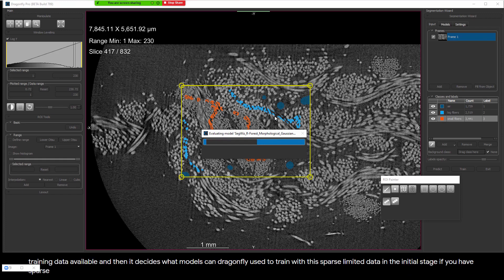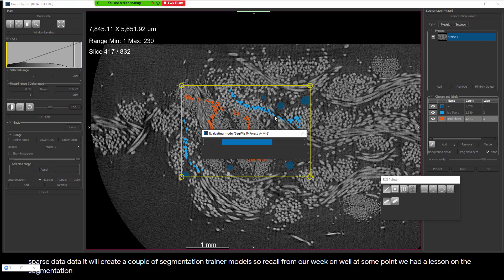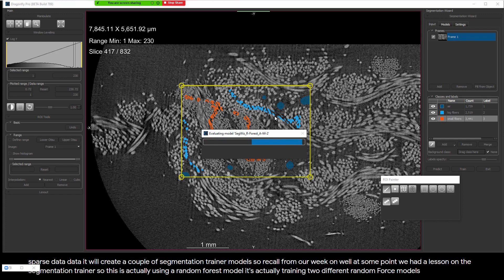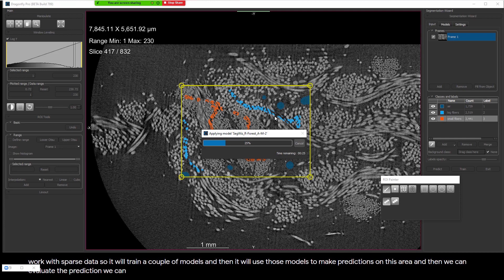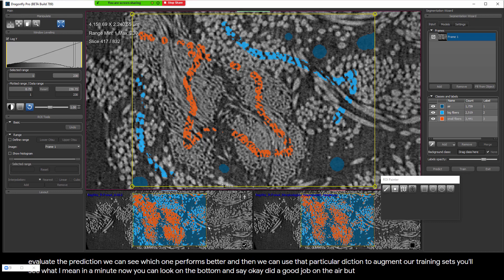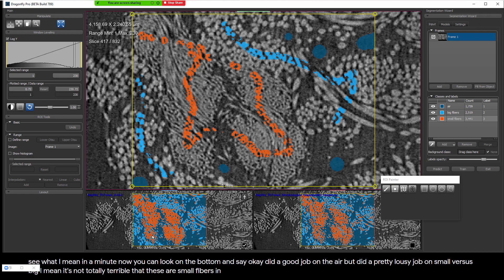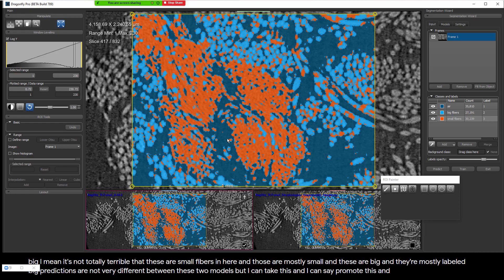When I hit the Train button, it looks at all of the frames — in this case just one frame — and it looks at the training data available and decides what models Dragonfly can use with this sparse limited data. In the initial stage with sparse data, it will create a couple of segmentation trainer models using random forest — it trains two different random forest models because those work with sparse data. Then it makes predictions on this area and we can evaluate them. We can see which one performs better and use that prediction to augment our training set. Looking at the bottom, it did a good job on the air but a pretty lousy job on small versus big. Predictions are not very different between the two models, but I can take one and promote it and edit it.